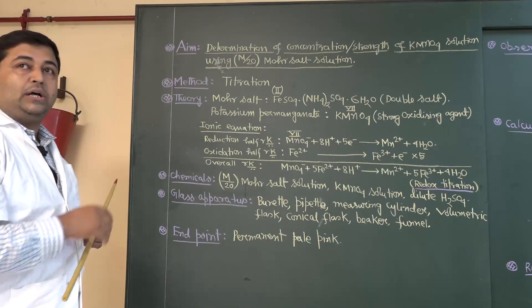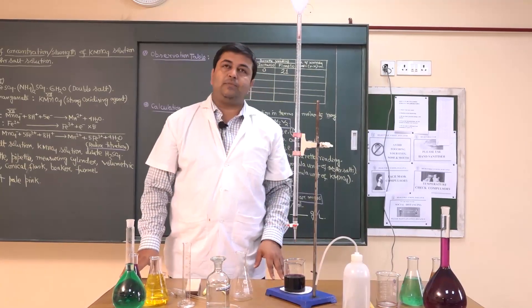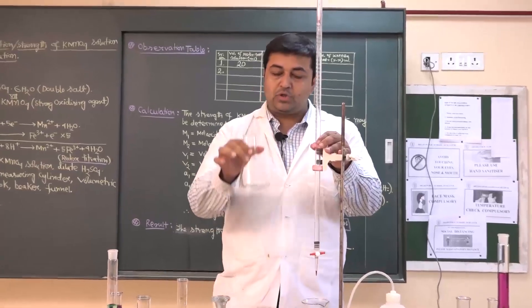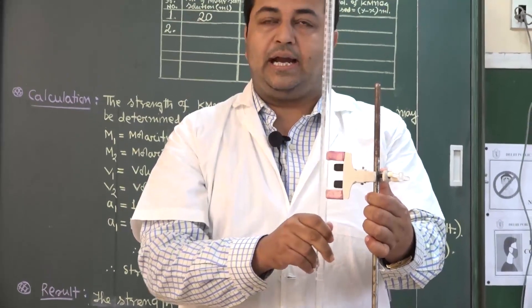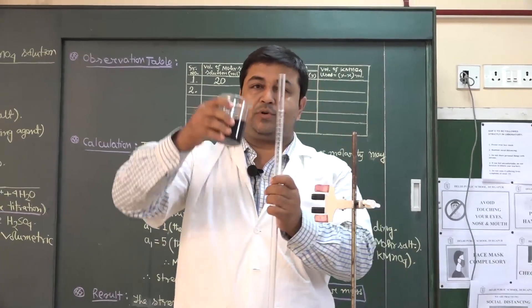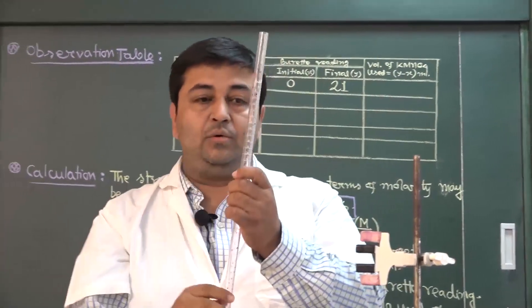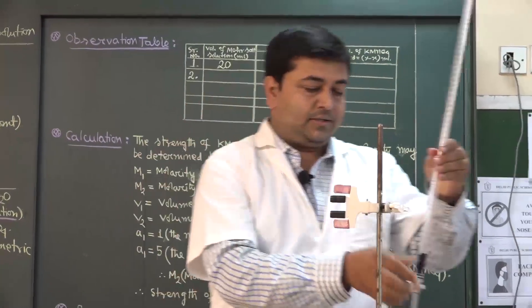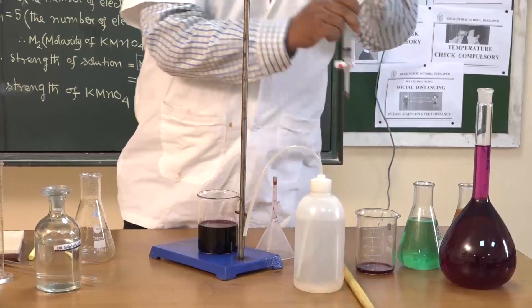Now we will go to the main practical part. We will take potassium permanganate solution in the burette and Mohr's salt in the conical flask. Before filling the burette, we will rinse it first. I take a little KMnO4 solution in the burette, roll it, and discard it. Now I will clamp this burette with the burette stand.